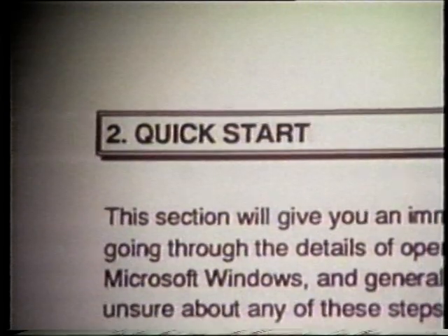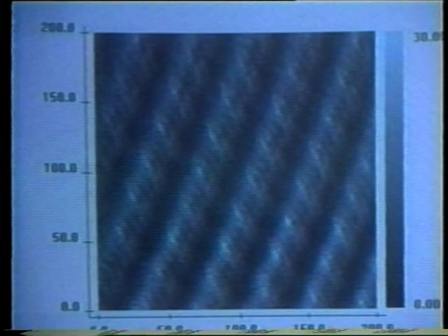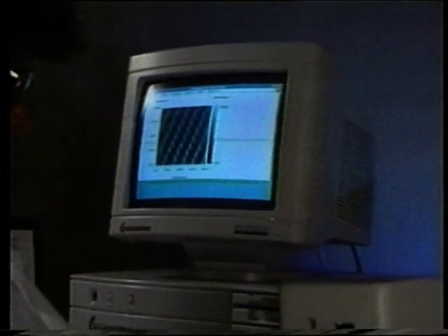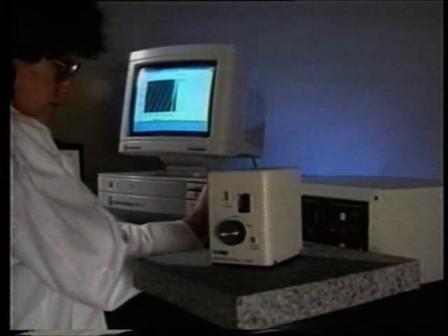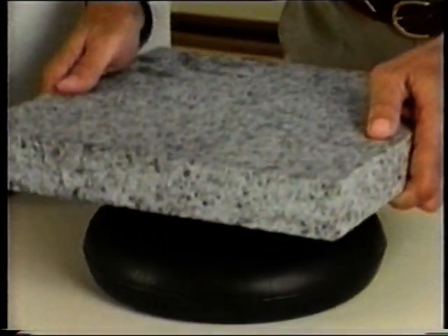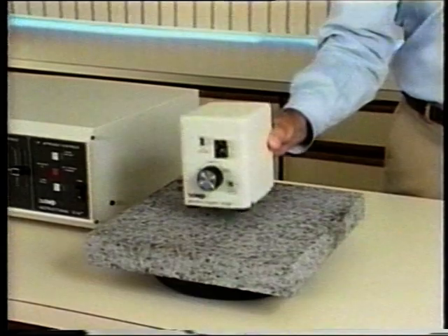The Quick Start section of your operation manual provides easy-to-follow, step-by-step instructions and allows you to quickly confirm that your new system is operating properly. Following the instructions in your manual, select the location for your Instructional STM that will allow easy access to the instrument. Be sure to avoid any source of vibration. It may be necessary to place the scanning head on a vibration isolation table or on an insulator such as a simple inner tube with a heavy top plate.